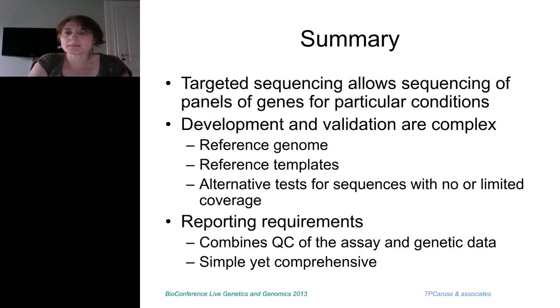So in summary, we don't have one method that will solve all of our problems. Both methods have their good sides and bad sides. And targeted sequencing is really going, I think, ahead with a lot of panels for particular use, for oncogenes, for carrier screening, for particular diseases. And I see this as a future really where it's going.